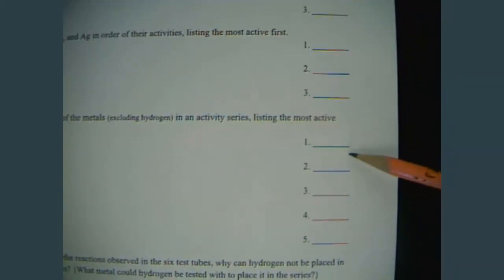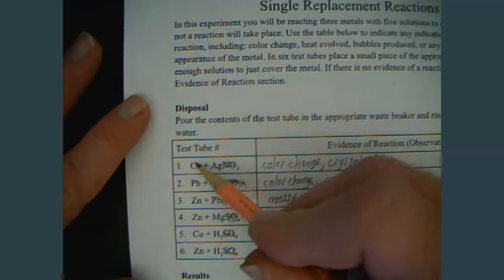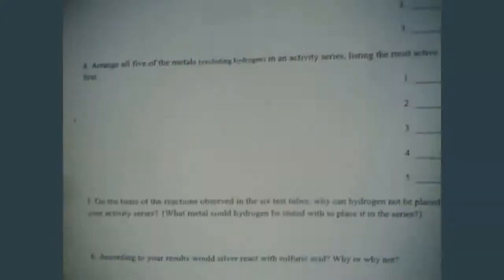So the magnesium, silver, copper, let's get them all here, the silver, copper, lead, zinc, and magnesium in order. So, we're excluding hydrogen.